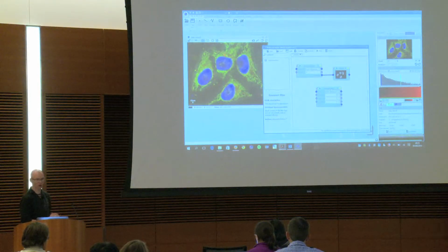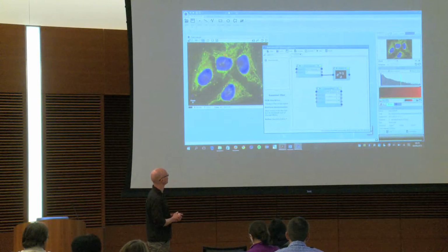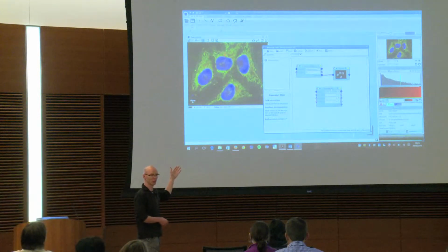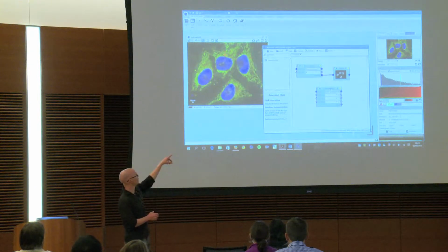Okay, so now can you tell me how I have to connect the two blocks together? Which output I have to connect to which input? So I guess you know that I will use the extracted output from my extract channel because I want to process the channel 2. So I need to connect the extracted output to the input of the Gaussian filter.